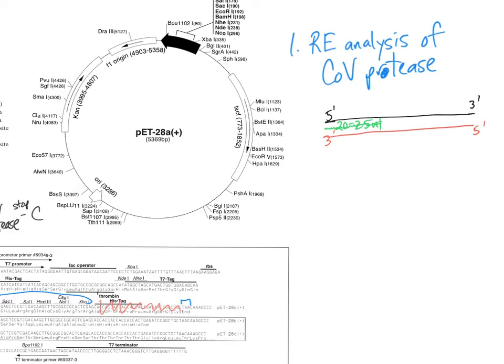But it's going to look exactly like, so it is the exact same sequence of what you see. So clearly it would start with that, I think it was an AGT. So there's your guidance there. But then we're going to end up putting 6 nucleotides here. That's going to be your restriction enzyme 1. And then 3 nucleotides, that's going to be, I think I said GCC. Well, guess what? That's it. I mean, that is your primer. That's your first primer, right?